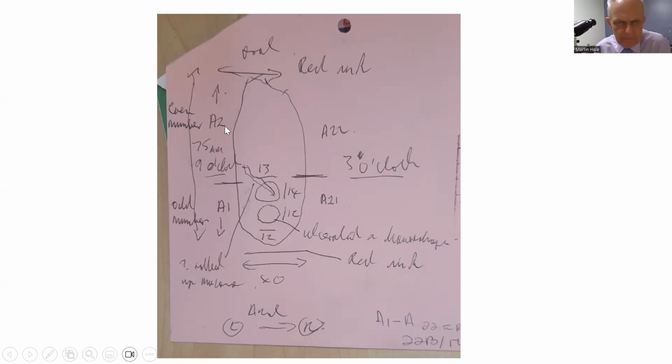Now, the next thing is that because this is 75 millimeters in length, it is too big to go into one cassette. So I have to divide it. That's why, when you see there, I've got red ink and red ink there, and I showed you that on the previous diagram. So when I come to assess it, I now breadloaf it in a longitudinal manner. And you'll see that I've put a line across there, and that represents the area of division, which I've not arbitrarily decided, where I divide this piece of tissue.